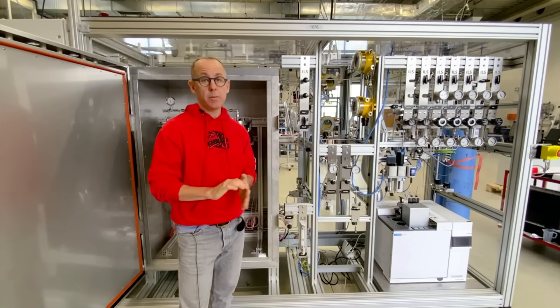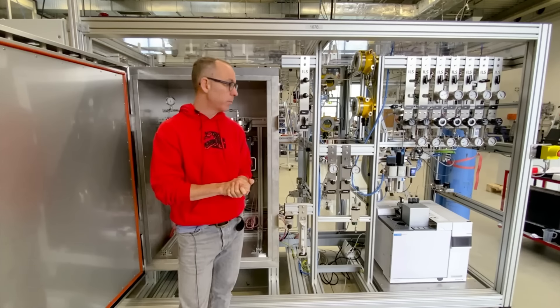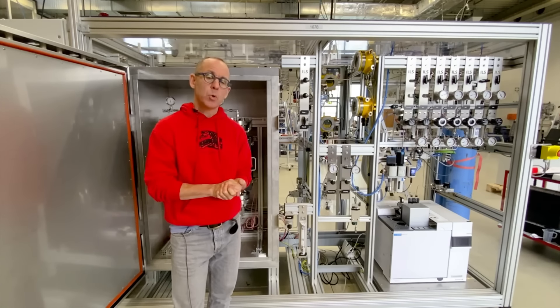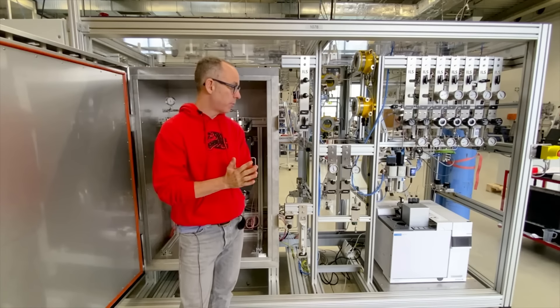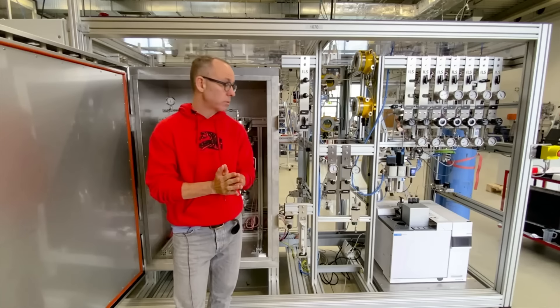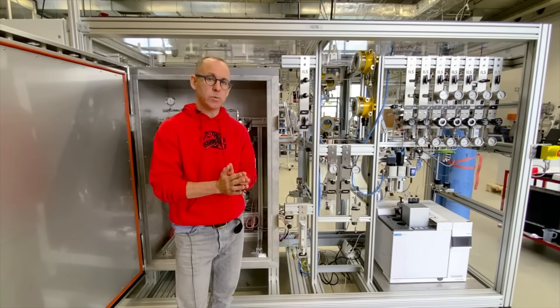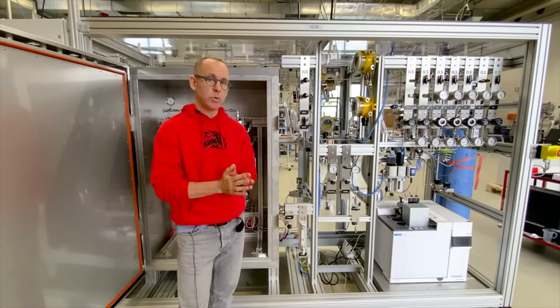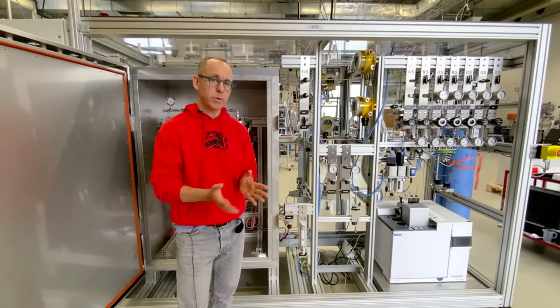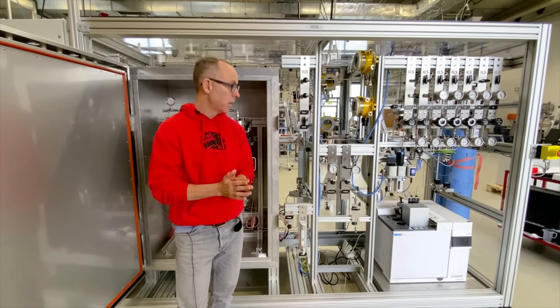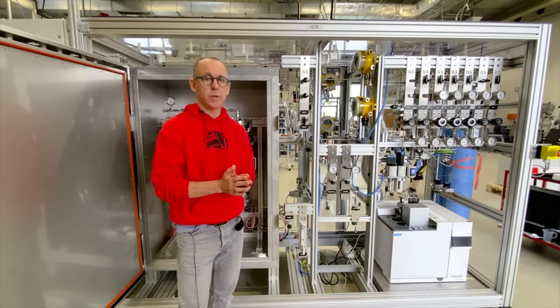The unit is fully automated on the Siemens S7 system and we use our ILS workflow manager to help the unit be operated with basically the click of the mouse. You can generate multi-step recipes very easily this way and it automatically pulls in the data from the GC and combines it with the process data from the Siemens system, giving the user a complete overview of all the relevant catalyst performance parameters.